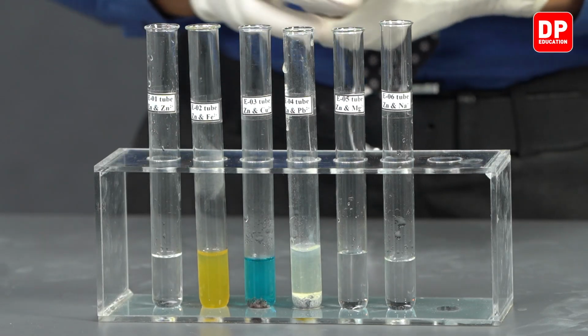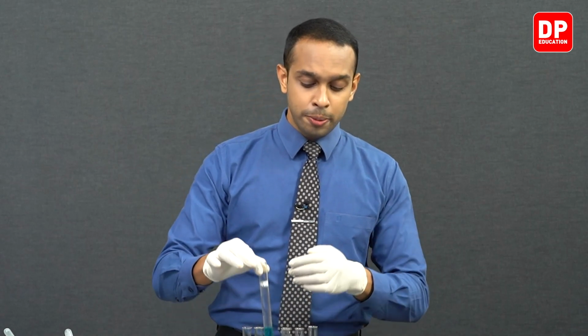So that would mean zinc is more reactive than iron. Zinc is more reactive than iron, and zinc would be found above iron in the reactivity series. Then we move on to copper.